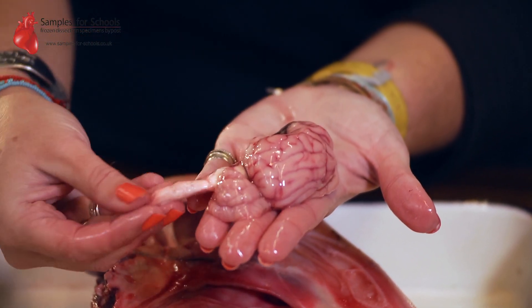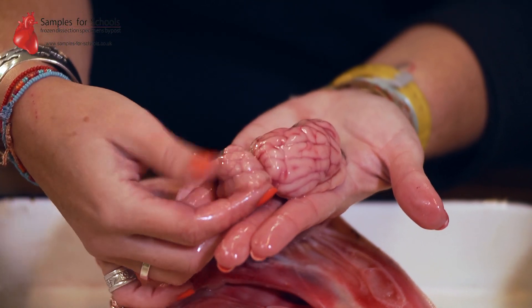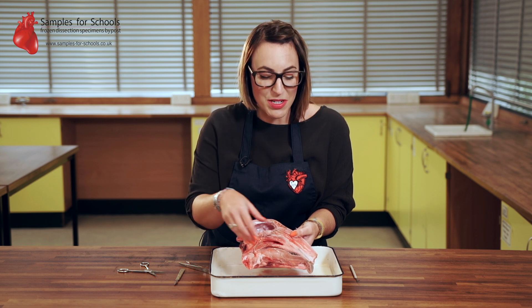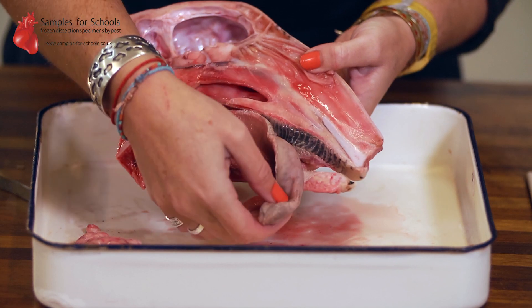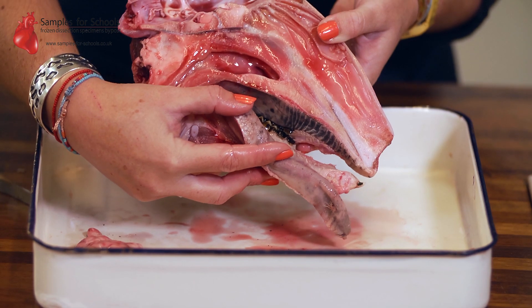At the rear of the brain we have the brain stem and the cerebellum. Another feature that you can identify in your specimen is this thick muscle — this is its tongue — and if we lever it to the side you'll be able to see all those teeth that are responsible for chewing the cud.